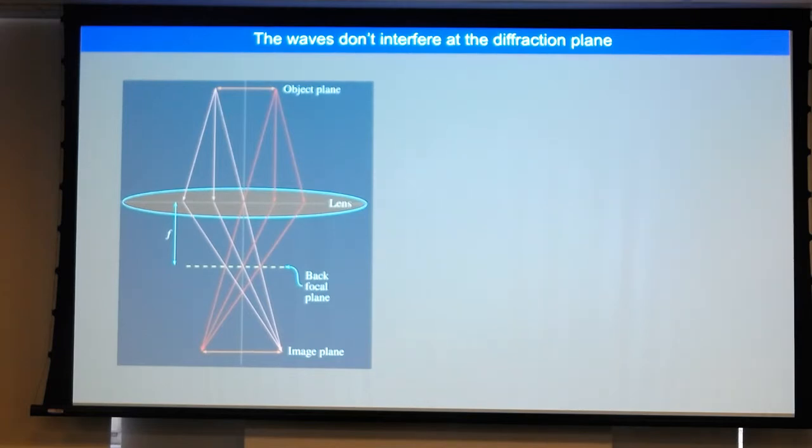The phase plate changes that one in the wave function into an i. It shifts it by 90 degrees, and that changes the whole form of the contrast transfer function. So what we do is we put a device here that shifts the phase right at the unscattered wave, and doesn't shift the phase of these two scattered waves, and so we can modify what the contrast transfer function does, because we're really thinking about the contrast transfer function.